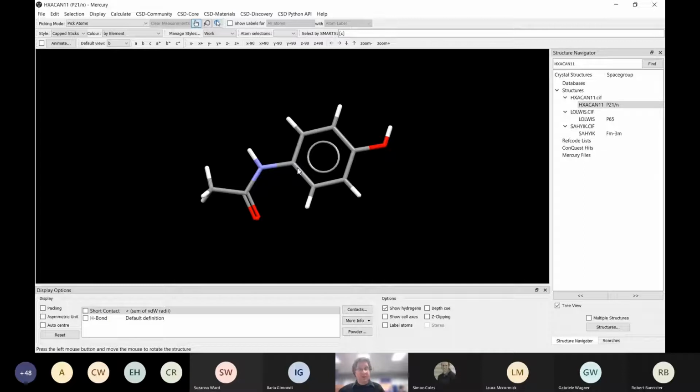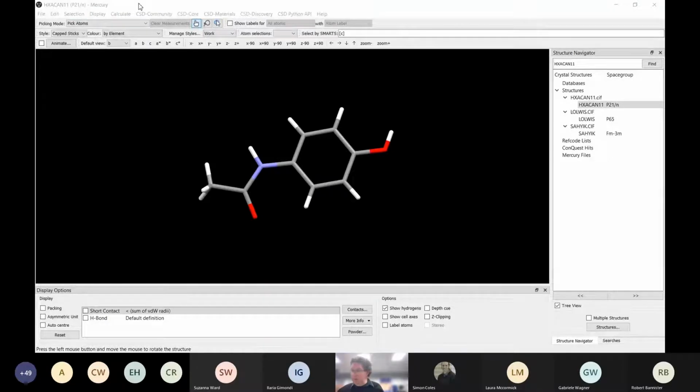As a crystallographer, I prefer just seeing bond connectivity. So if I want to get rid of them, I go into styles, and there's two options here, which is display bond types and style display aromatic rings. If you want them in, I can go back in and put them back in, just tick them, and if I don't, we take them back off. But we'll see what happens later in the structure when we do the diagrams, whether you need them or not. As I say, some people like them. I prefer just to look at the connected and just see what is connected to each other.